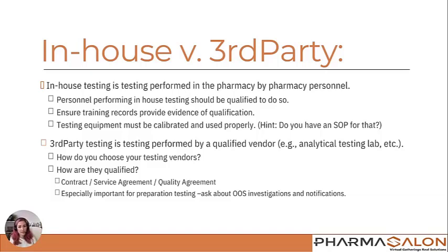Third-party testing, that's the testing performed by a qualified vendor. Some things I want you to think about there are, how do you choose your testing vendor and how are they qualified? If you don't have a vendor qualification program, I would highly suggest that you do it, even if it's a simplified version, just so you have something to say, we vetted that this third party has good quality and has good processes in place.